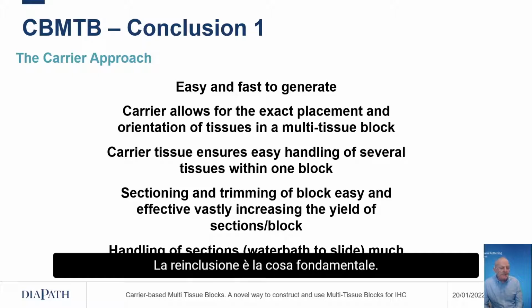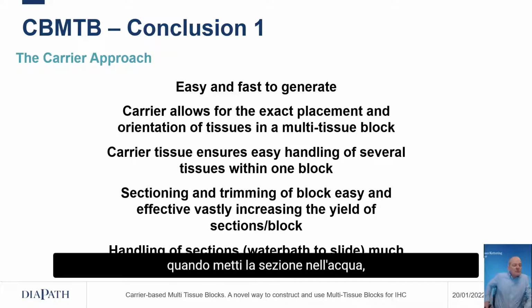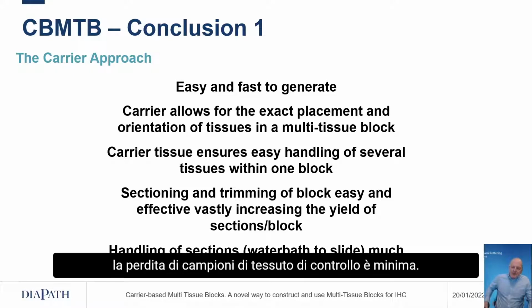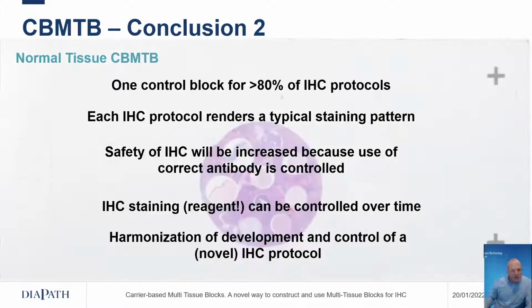Re-embedding is the key thing. The handling of the section is also easier because when you section them and put them in the water bath, the loss of cores or punches is minimal. It never happens to you. If you ever work with other multi-tissue blocks, oftentimes you lose some of the cores when they're placed in the water bath and then when they go from the water bath onto the slide.